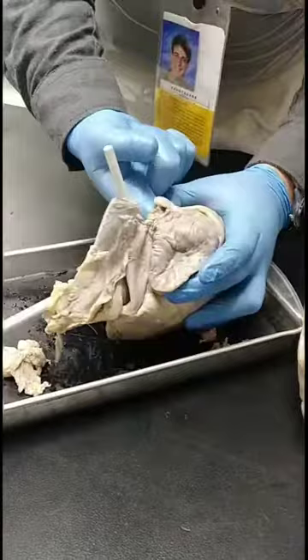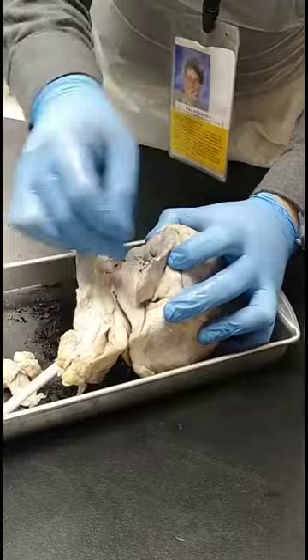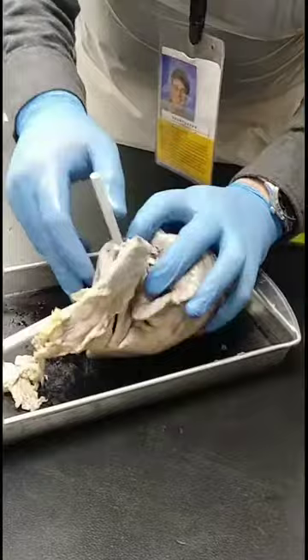The auricle covers the atrium. It kind of expands a little bit, gives it some more room when it's full of blood. Normally, it's bigger when it's full of blood, but it's all gone. It's been squished a little bit from being vacuum sealed. You just have to imagine what this looks like beating.